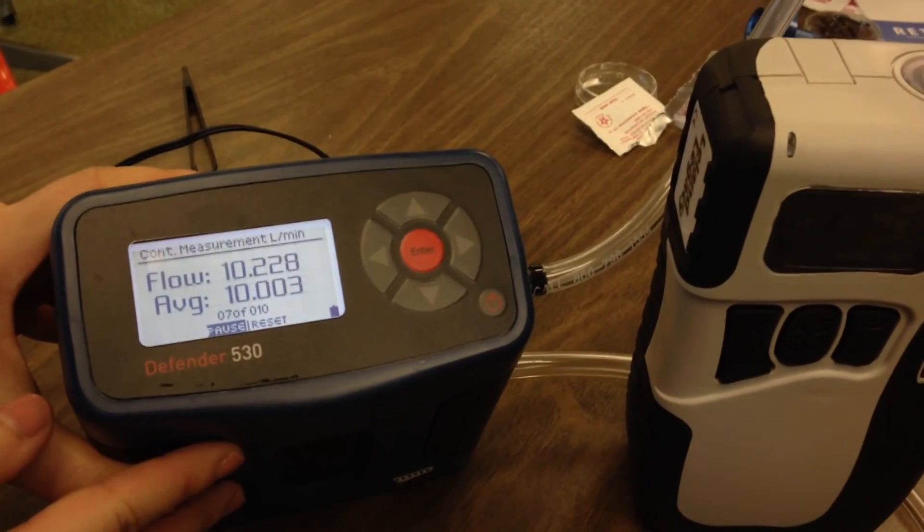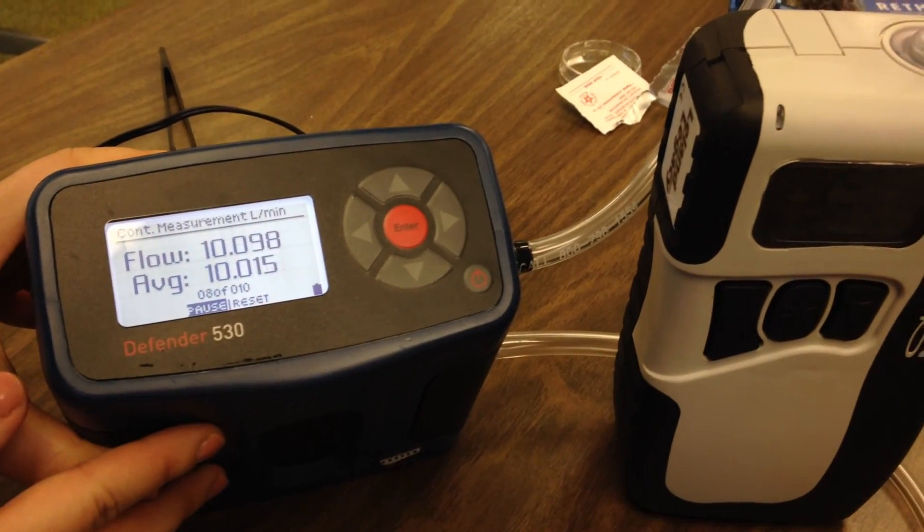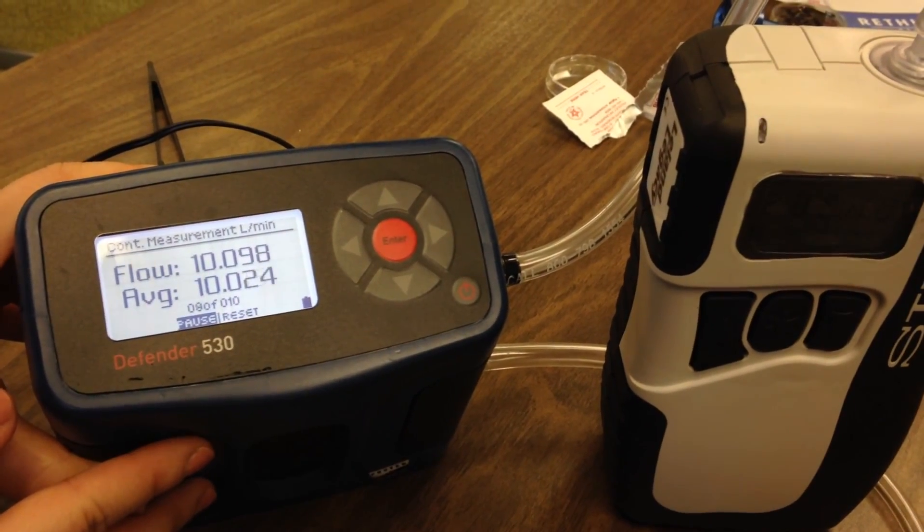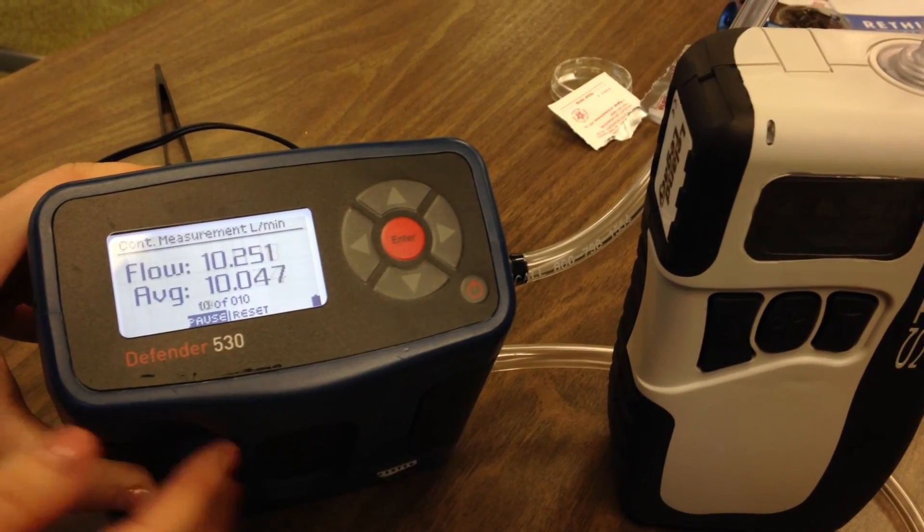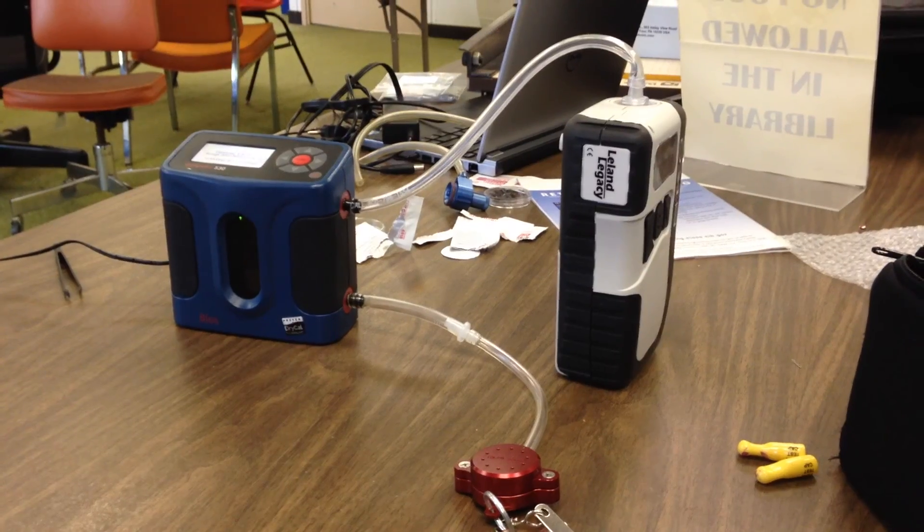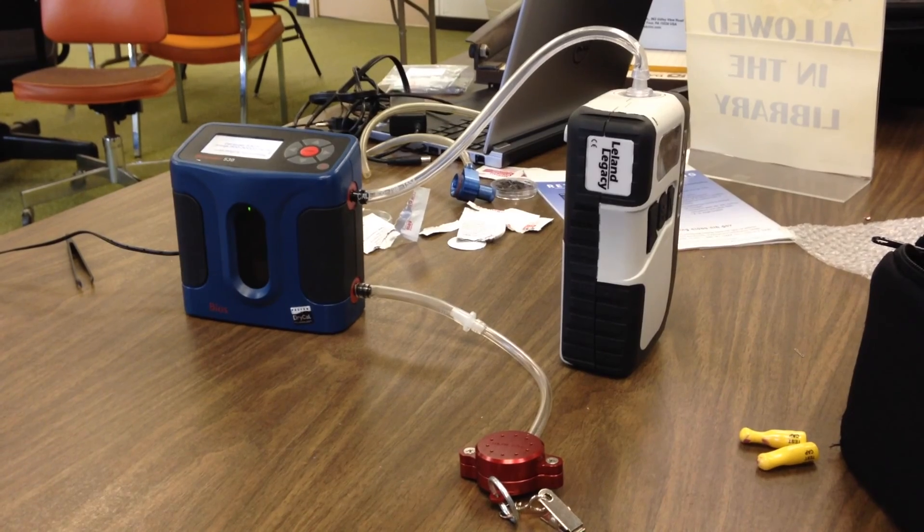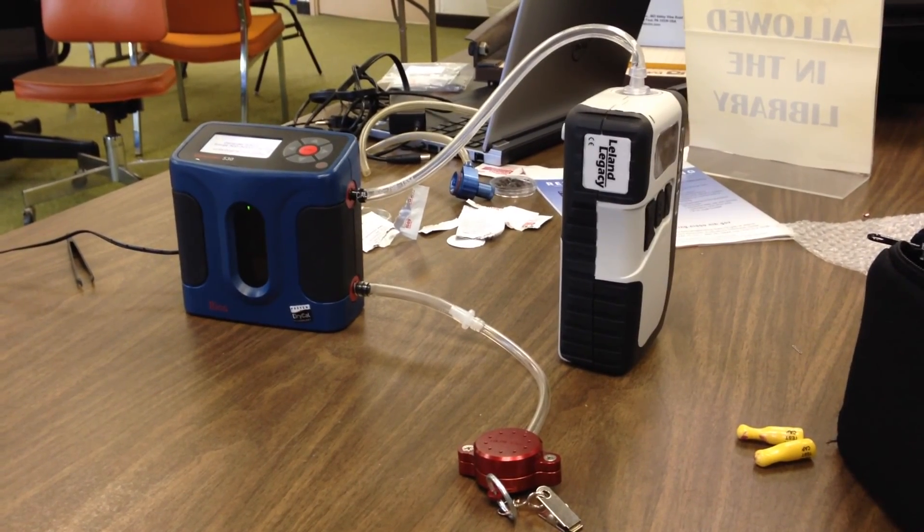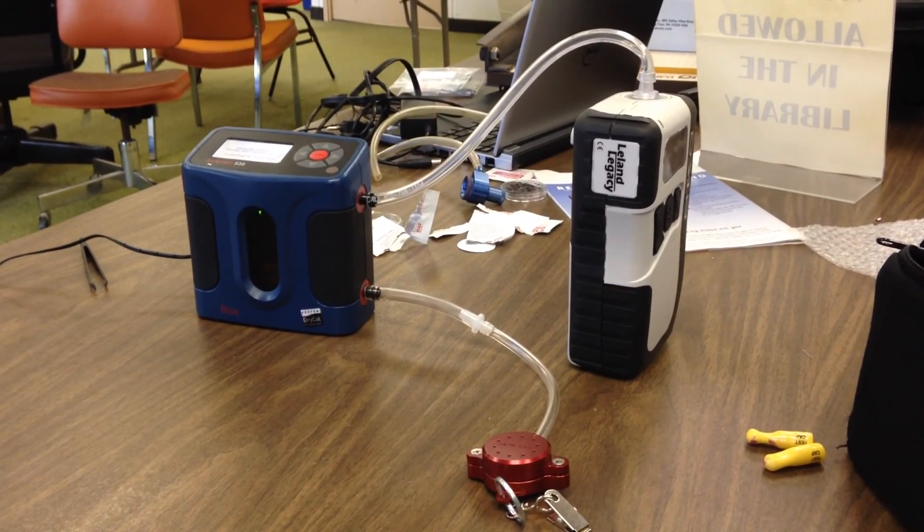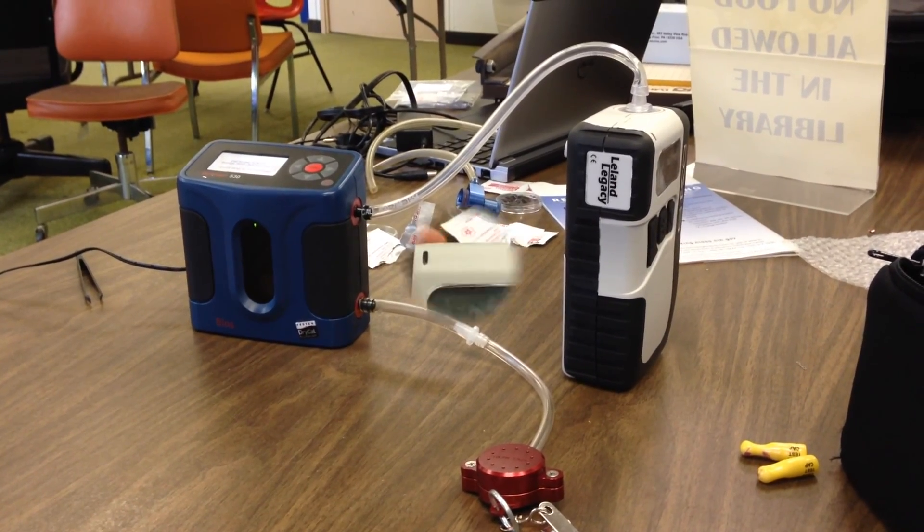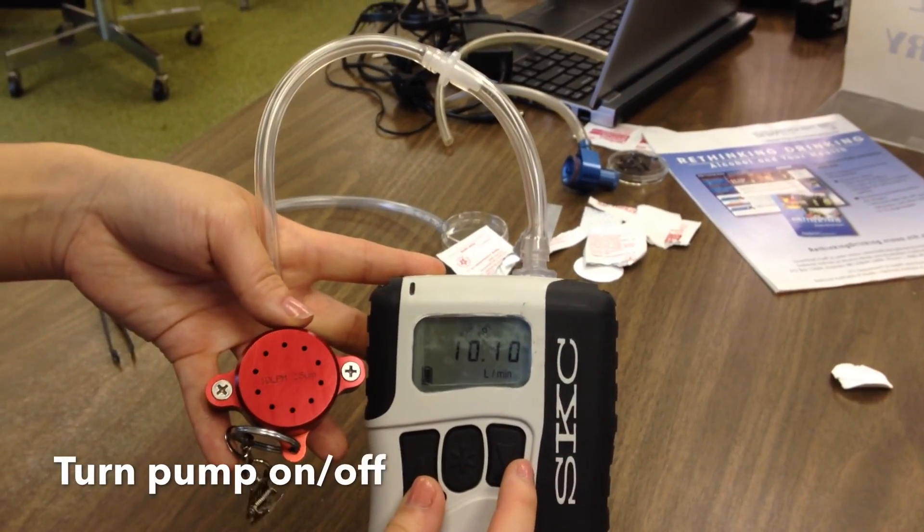The display should read 10 liters per minute. In order to adjust to your desired airflow, you can go to the setup option in the legacy pump and use the up and down arrows. Using a flow calibration cap, the PEM can also be connected in series like the XAD4 tube in between the calibrator and pump. Both calibrations will yield the same results.